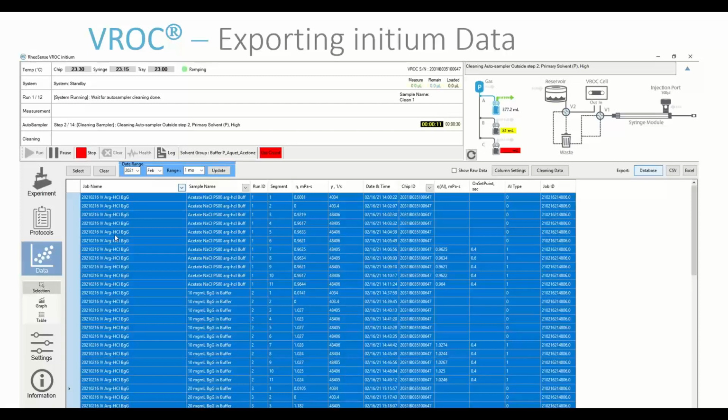So this is the Initium window. Like I mentioned, this is actually the data window, so that's why the data tab is highlighted. No matter which window you choose, the top part of this window will always be visible. It tells you the temperature of your chip, your syringe, and your tray. At this point, in this screenshot, I was running another sample, so you can export your data while you're running your next sample. It had just started, so it was cleaning the autosampler at the time, and it can even tell you which solvents are being used. It also tells you what chip you're using.